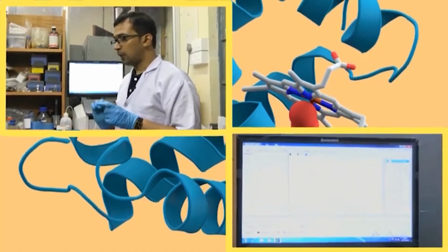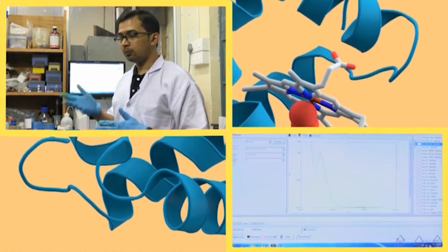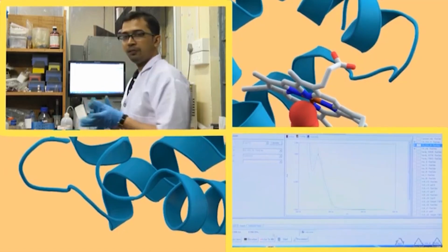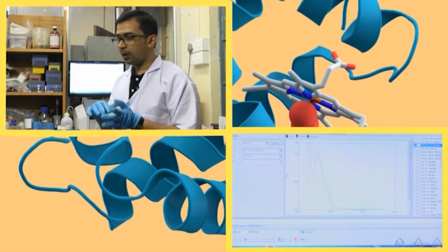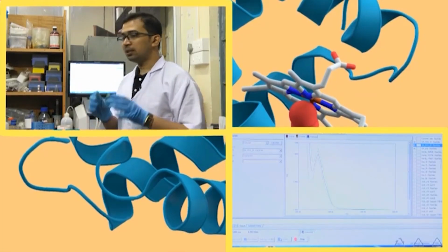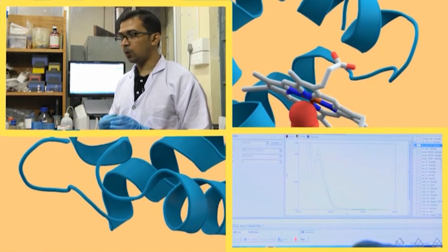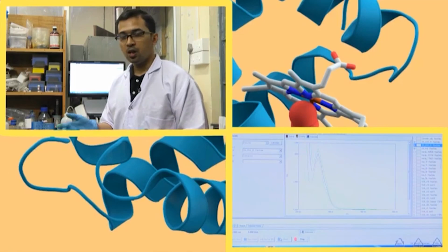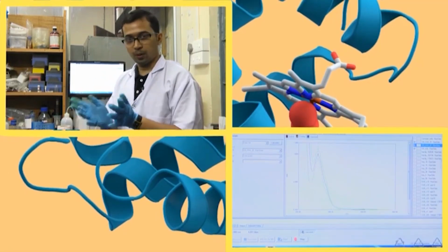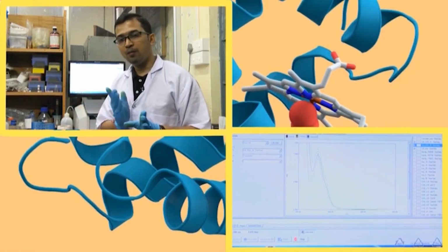Why? Because when you plot, you might see that some readings have errors. Out of a minimum of 8 to 10 readings, you can see 3-4 readings might have errors, meaning the change is not in the regular fashion in which it should have been expected. In that case we have to just omit those readings. But if you have only 5 readings and you omit 3 of them, you are left with only 2 points and you can't draw any acceptable straight line. Okay, you can draw a straight line through 2 points, but not for any experiment. For an experiment you need a minimum of 5 to 6 points.